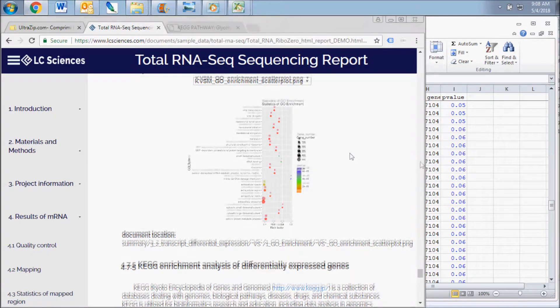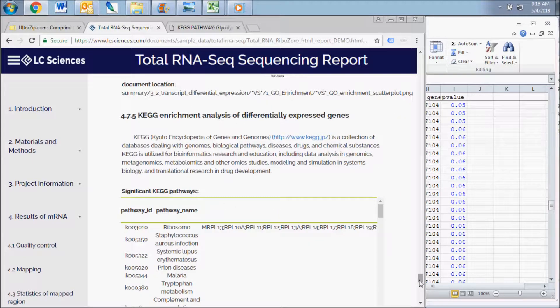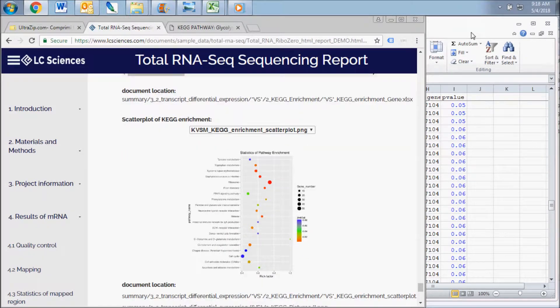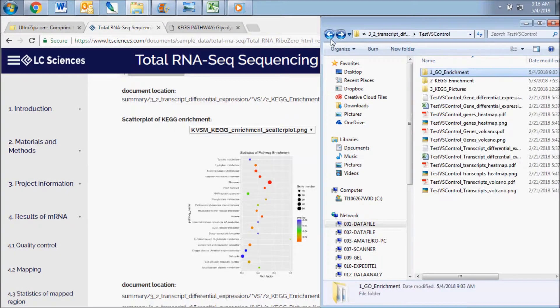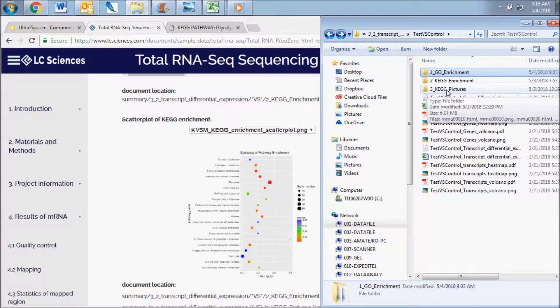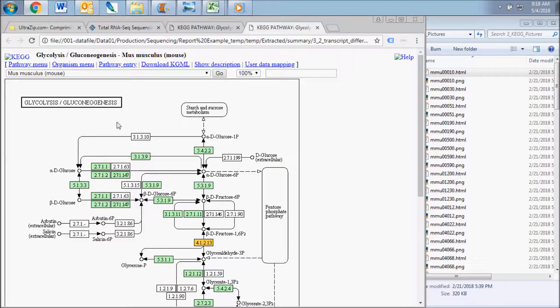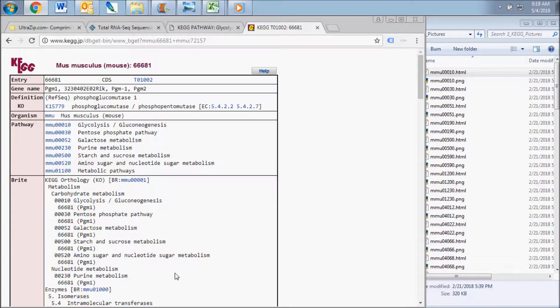A similar analysis is included in the KEGG enrichment folder for enrichment of pathways from the Kyoto Encyclopedia of Genes and Genomes collection of databases. In addition to the chart and scatter plot of enriched pathways, this analysis also includes graphical pathway maps which are described in the report and found in the KEGG picture subfolder for each comparison. The HTML file for each pathway map contains clickable map objects that link to the KEGG database and enable further study of the enriched pathways revealed by your data analysis.